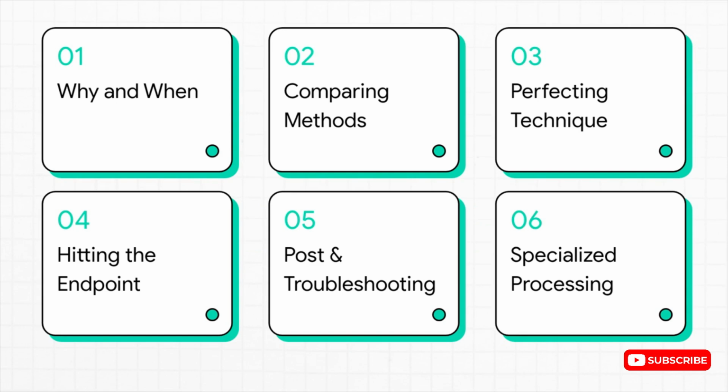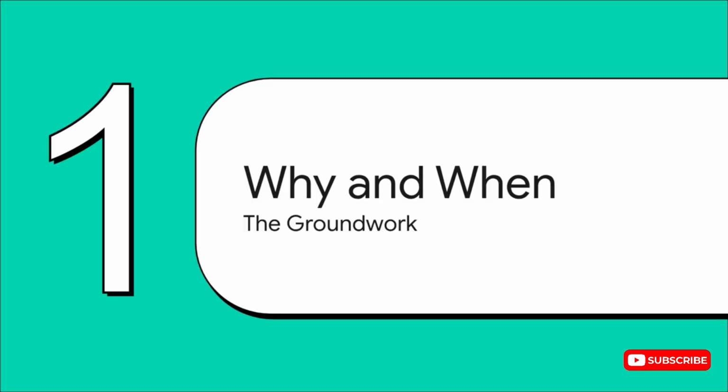So here's our game plan. We'll start with the why and when. Then we'll compare the different methods out there. We'll talk about how to perfect your technique, and maybe most importantly, how to know when you've hit the endpoint. After that, we'll cover post-decalcification steps and troubleshooting, and we'll finish up with some specialized bone processing. Let's jump in. Okay, let's start at the very beginning.